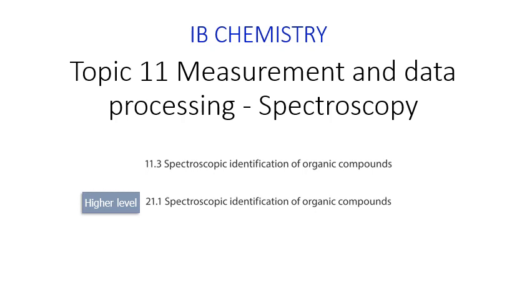So welcome to the component around spectroscopy, how we analyze compounds to make sure we've actually made the compound that we think we have. And there's two sections, an SL component and an HL component. Today we're focusing on the SL component, spectroscopic identification of organic compounds.